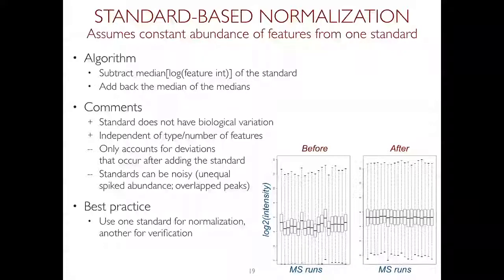What I've seen, especially in earlier days, is people saying, you know what, these days computation is so powerful and fancy, let me just throw all the data at it and see what happens. Not much happens, right? It's really good to put prior information in as much as possible. So really the important points are that eliminating proteins or features which are not serving you upfront will help. And the other is not to use the same data twice, because otherwise we overfit.